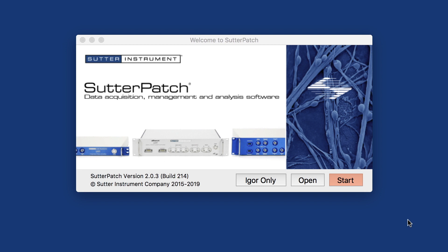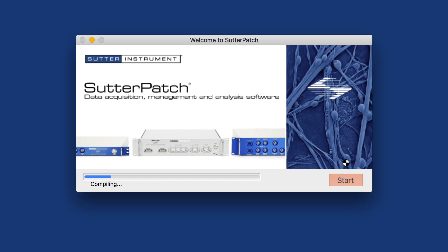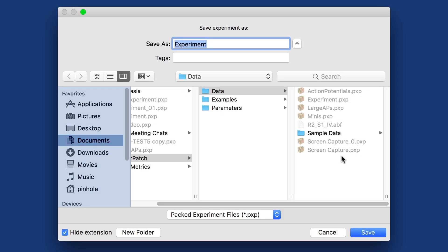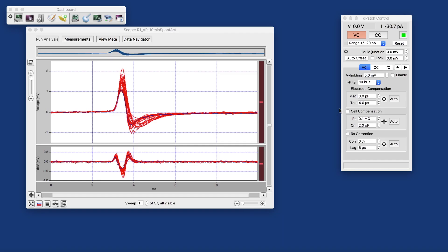It will be only a subset of what's available. Let me start Sutterpatch. The first thing once you start it is it assumes that you want to record data, so it will ask where you want to store your data, and I will save that as 'screen capture' because that's what we're doing here. This is mainly to show the visualization of the data.